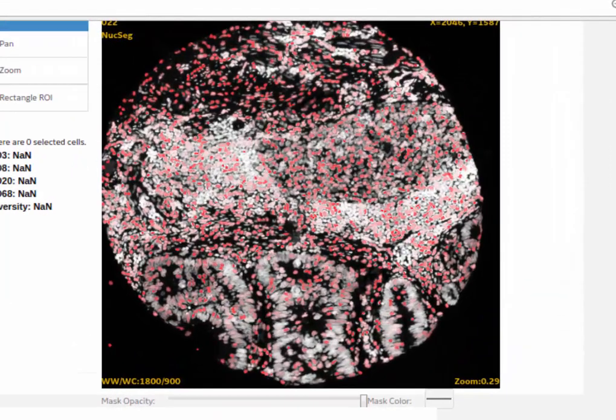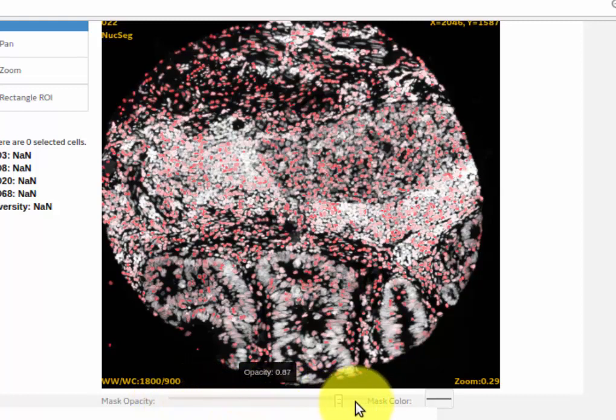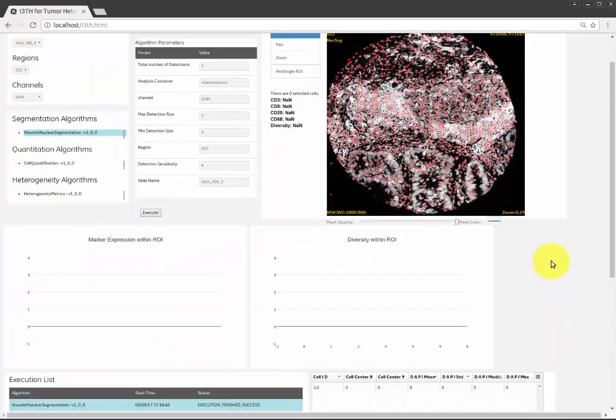The cell segmentation mask can be inspected and its opacity interactively adjusted to visualize the underlying fluorescence image. This is one straightforward segmentation algorithm. Thrive will provide several others currently in development and also an SDK for the research community to contribute still others.